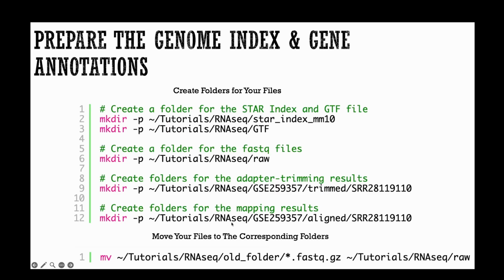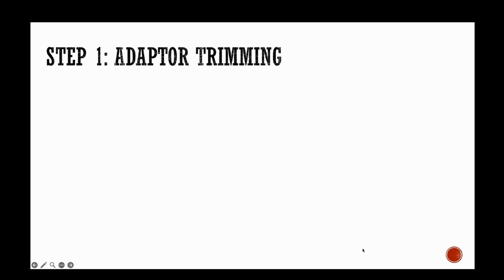And then we can move all the files using the move command. The format is: move the files in the old folder to the new folder. So with all the data prepared, we can finally start processing our data.